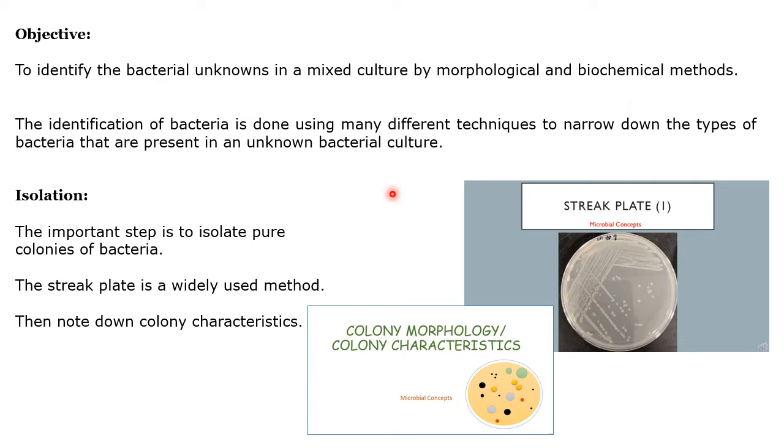Also, after identification we need to check whether the culture I am handling is a pathogen or not. Till it is identified you don't know anything about the culture, whether it is a pathogen or not. So while handling any unknown culture, please follow some precautions so that you don't get any infection.